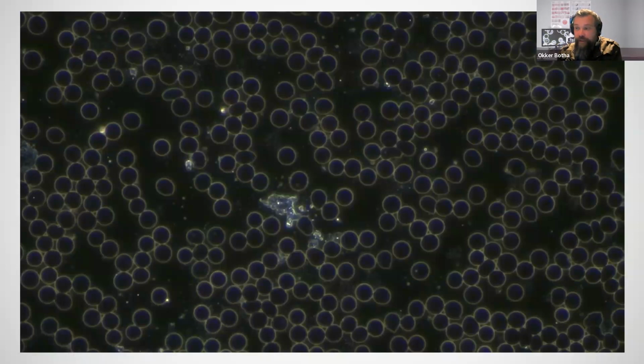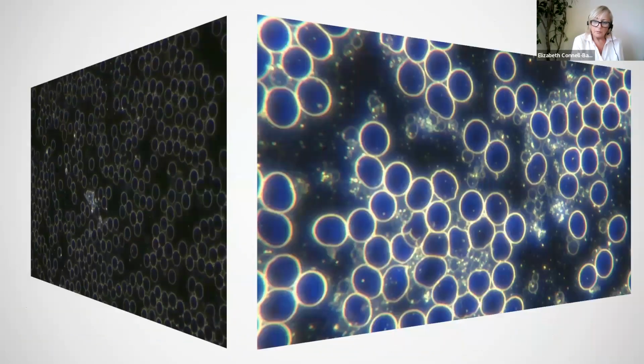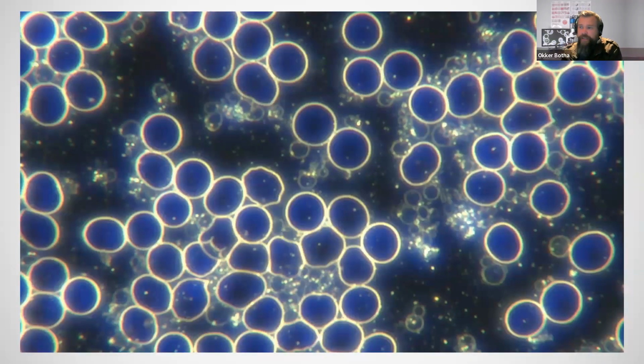So you often end up asking questions rather than getting answers. You're unsure of what you're seeing. It may be this or it may be that, and there may also be other things that are not visible at all. So it's quite difficult to use live blood analysis to its full potential if you're not able to actually see everything. You'd just be guessing with that, wouldn't you? Yeah, absolutely. And the value of live blood analysis is that it often takes the guesswork away. You often work out exactly what needs to be done, and you can focus on those issues, test again, and see whether those patterns have resolved.